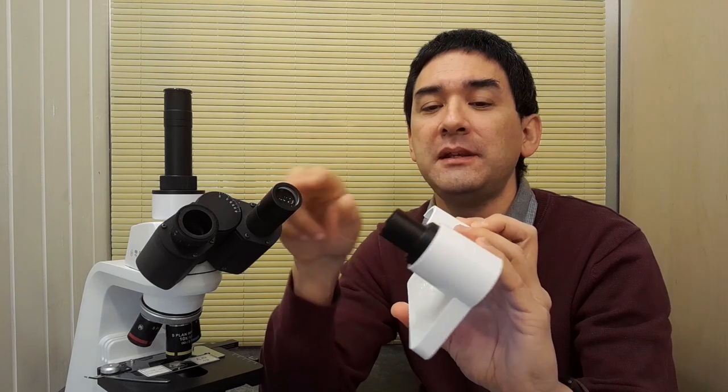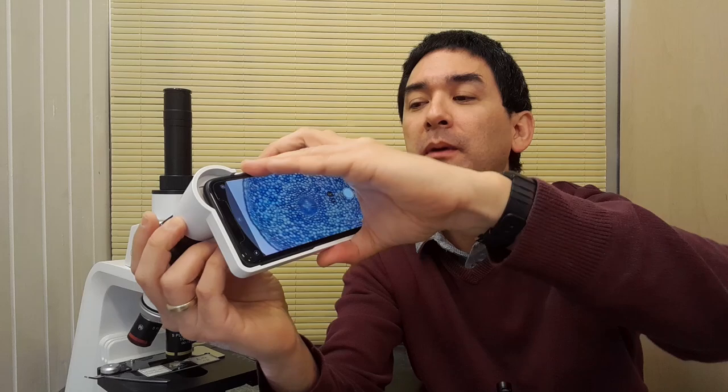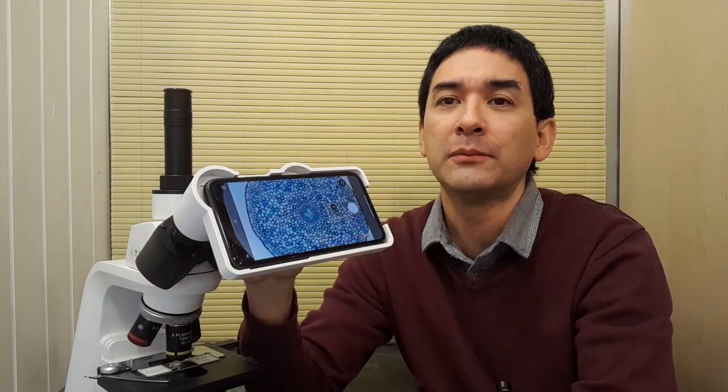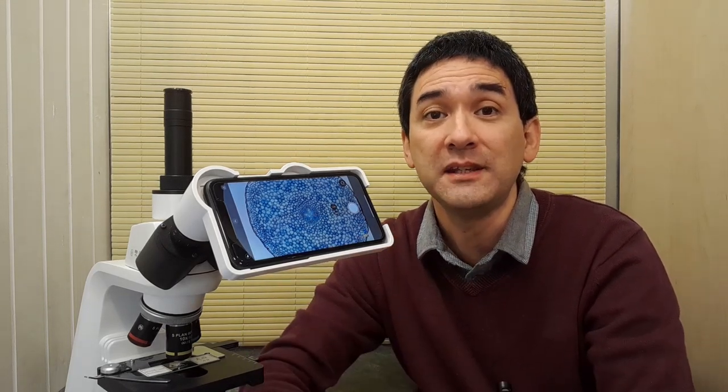Over here you can see that this is a resting place for the second eyepiece so this keeps the camera horizontal and therefore I think that's a very good thing because you can now keep the mobile phone camera attached and you can now use it instead of your eyepieces even.